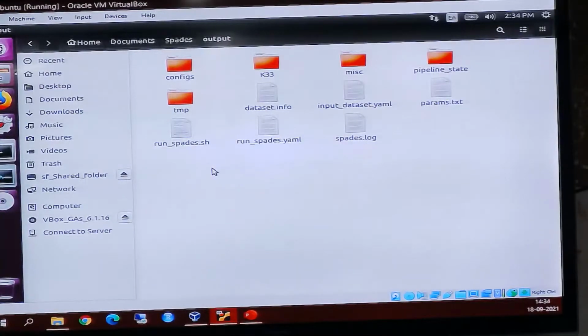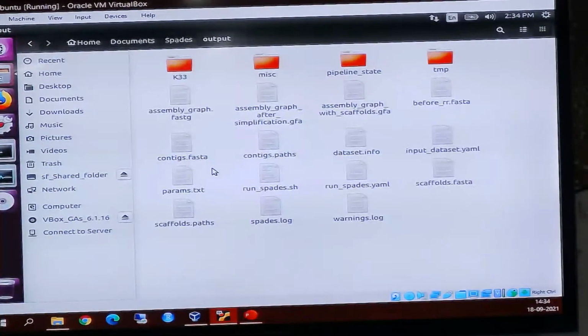Both. You sequence your data, go for data space, and on the basis of which, try to find out which variations you have targeted, what you have achieved. After that, I have given one control data for whole genome sequence. Now I am having that place. Before this, I have changed the files. Opening in desktop, it is not opening. Now I know the difference. So we ourselves can do now.